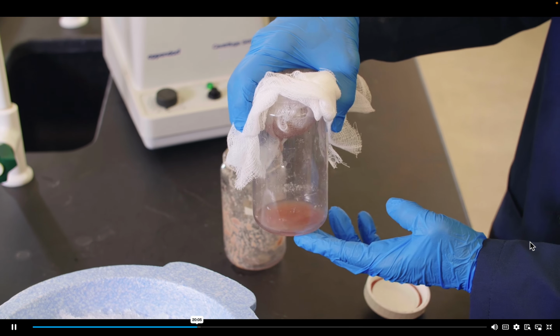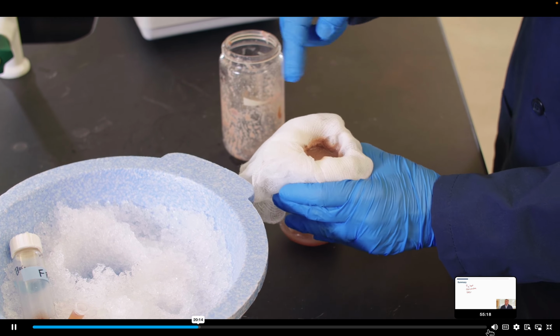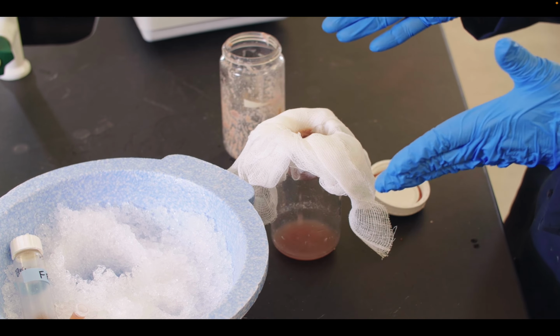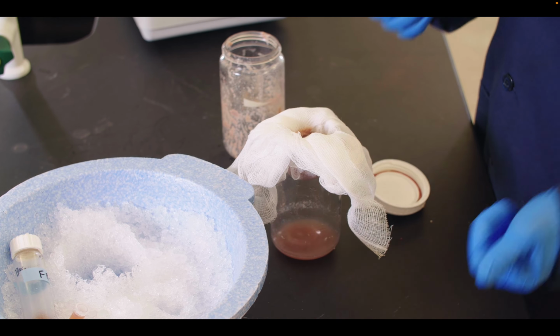And so we're going to allow that to drip, and we'll have some material left over. So it's going to take a little bit in the top. And we're going to see again, there's still water base, and so it's going to drip through there. Right? And so once it all drips through, we'll measure that, and we'll get a volume, and that will be our true volume for fraction 2. All right, so we're going to call this FR2, fraction 2.